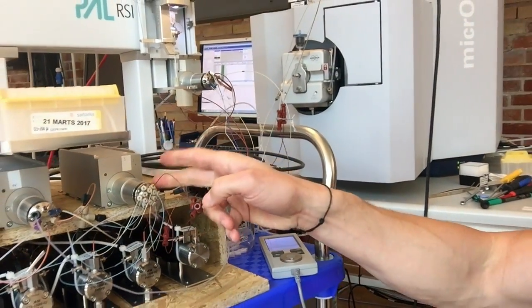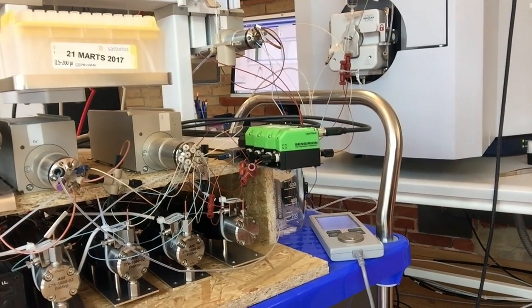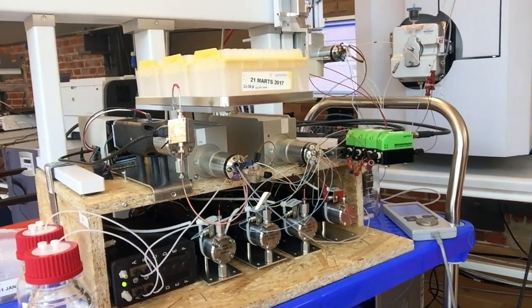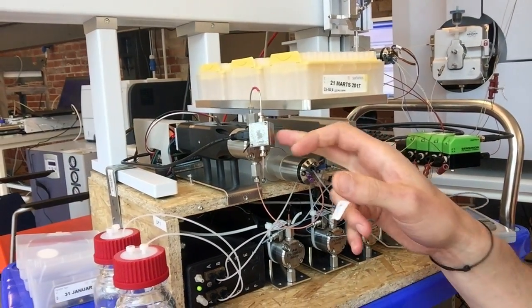We have consolidated all the low pressure operations onto one valve. This is a custom 12-port valve from Vichy. This is our high pressure valve, and here we have the high pressure pump and the pressure sensor.